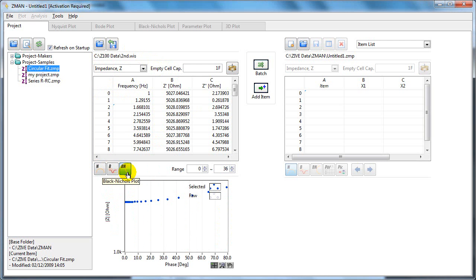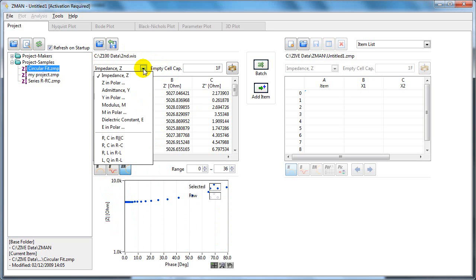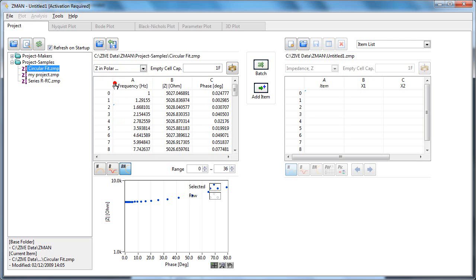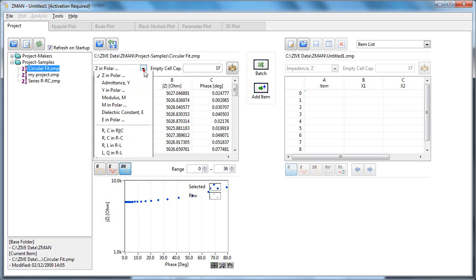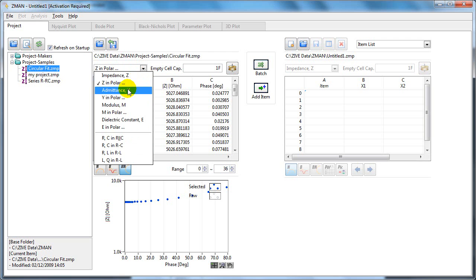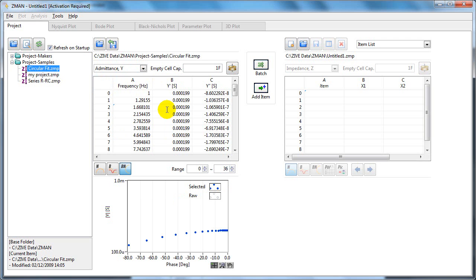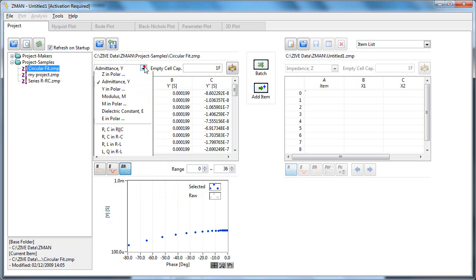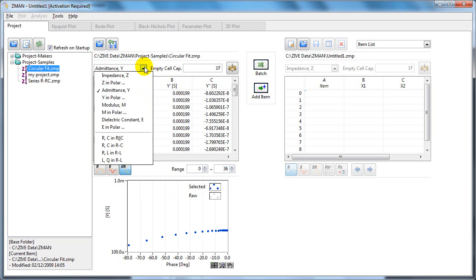There's various data formats you can display, so this is impedance. Polar means polar coordinate, so you can see that's updating both the table and the graph here as I choose different data formats.